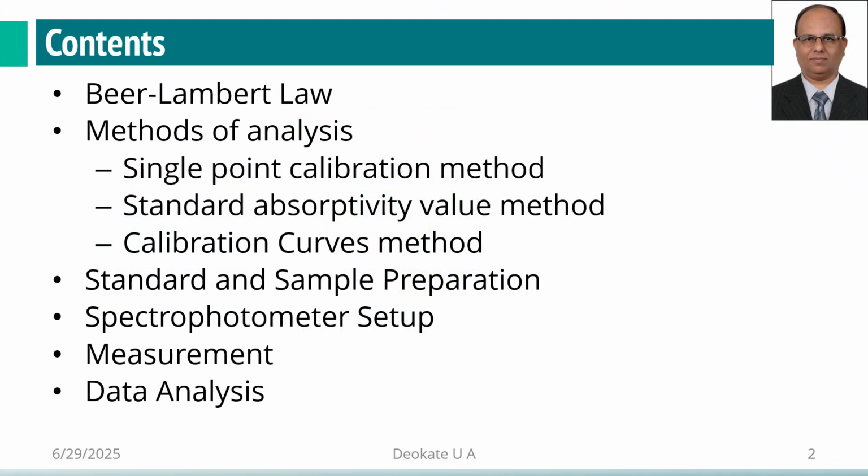The content of today's lecture is about Beer-Lambert's law, methods of analysis, that is single point calibration method, standard absorptivity value method, calibration curve method, standard and sample preparation methods, spectrophotometer setup, care and handling, how to do the measurements, and data analysis.